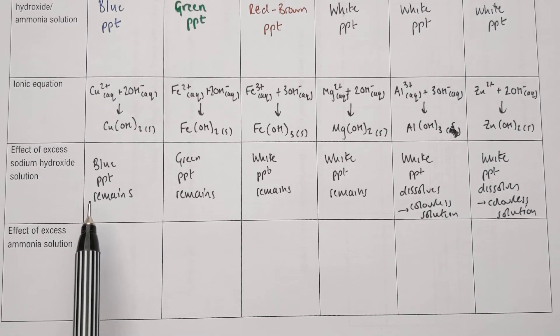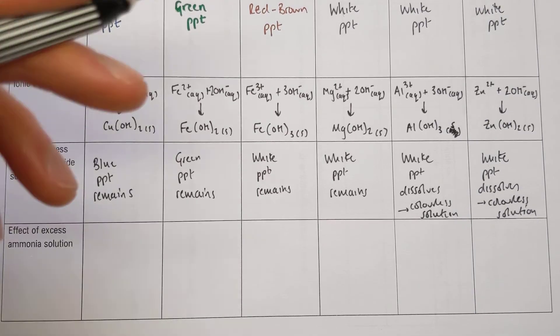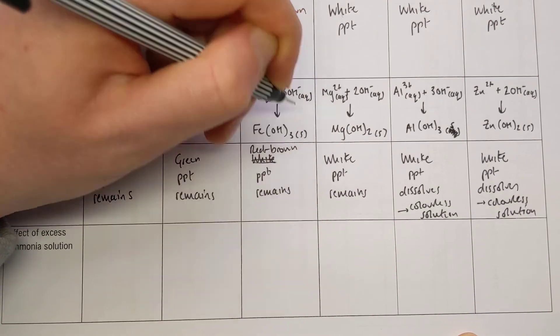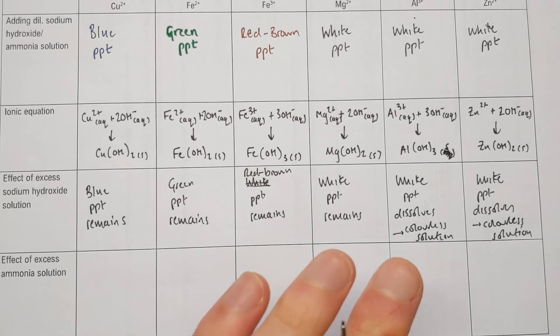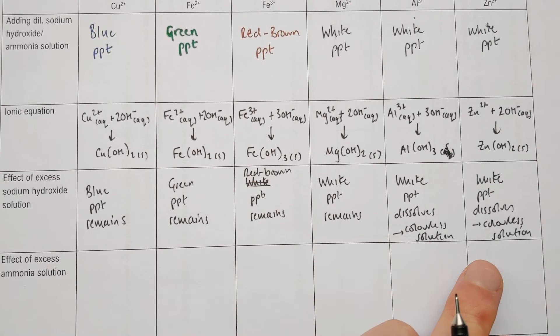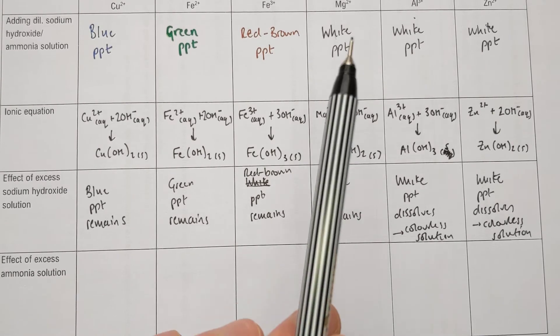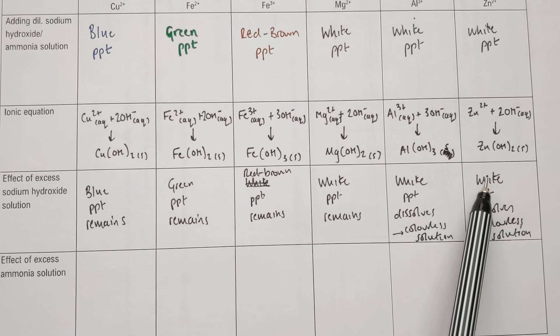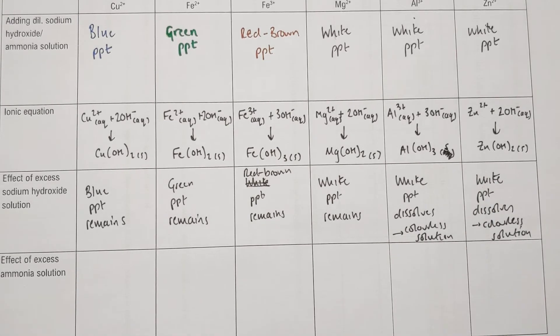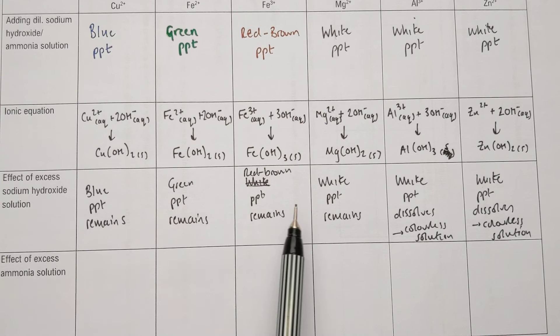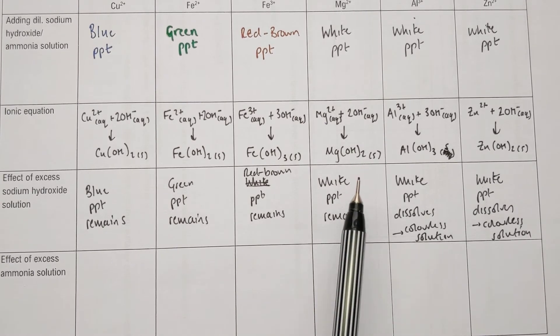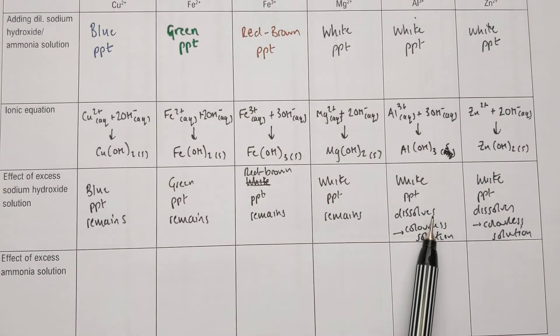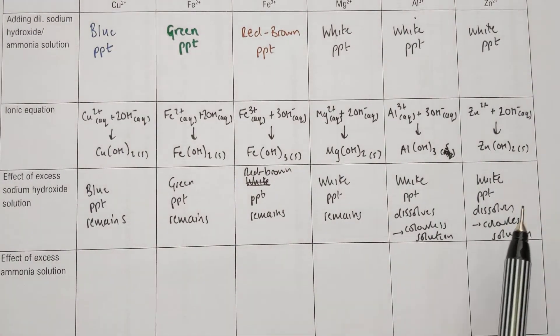Here are the results if we add extra sodium hydroxide. With our three colorful ones, nothing too interesting happens. The blue precipitate remains with copper, green precipitate remains with iron 2+, red-brown precipitate remains with the iron 3+. We have got something interesting here with our three white precipitates. The magnesium precipitate, magnesium hydroxide, doesn't do anything with extra sodium hydroxide. However, both the aluminum and the zinc precipitates dissolve again. They'll dissolve to form colorless solutions. So I still can't tell apart aluminum and zinc, but I could now tell if I had a magnesium precipitate because that would remain with extra sodium hydroxide.